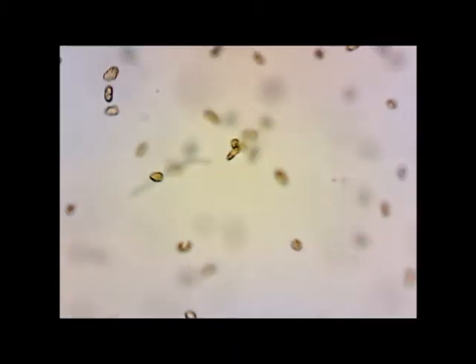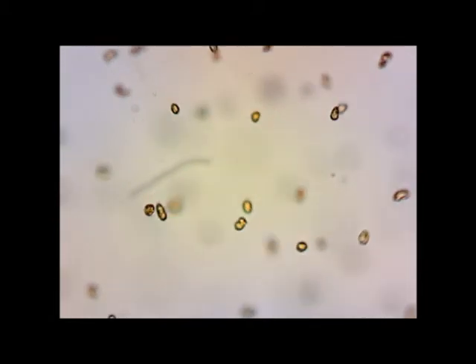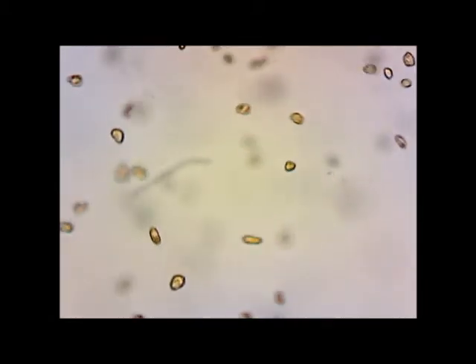If we look at the Heterosigma in higher magnification, we can see the chloroplasts around the edge of the cells and the paler nucleus in the center.